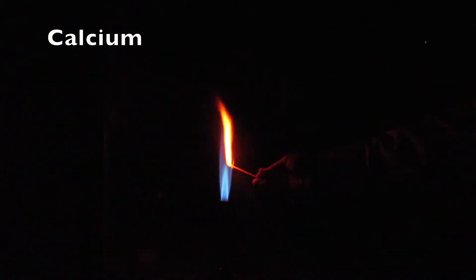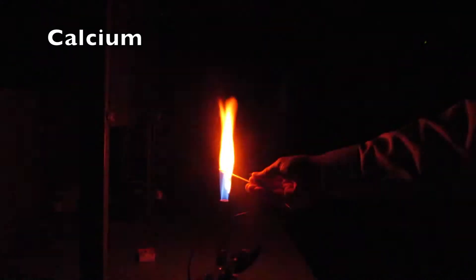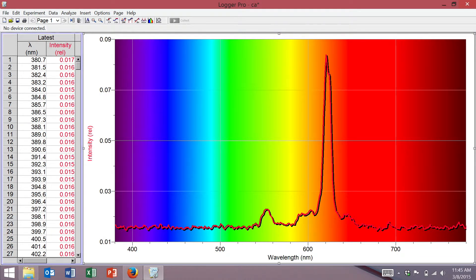Next up, we have a calcium chloride salt. Here we have a photon roughly a little over 620 nanometers, and there are also a few photons produced right around that 600 nanometer range.